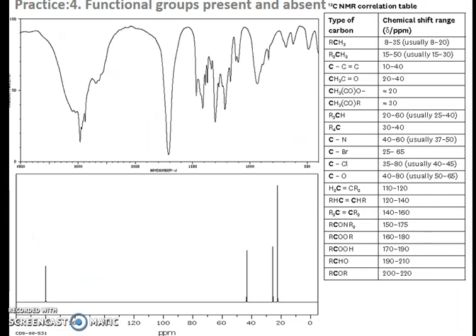Here is the last one that I'm going to look at tonight or today. And this one is also very distinctive. This one has my favorite fat and ugly peak present, which means that it is almost certainly going to have a carboxylic acid. So we've got a very broad peak at the top of the IR. We've also got a carbonyl group showing in the IR at about 1710. There's the peak at 180 in the NMR, which is also indicative of a carboxylic acid. And you've got the peak at about 20 ppm in the NMR, which indicates that you could have two carbons in the same carbon environment.